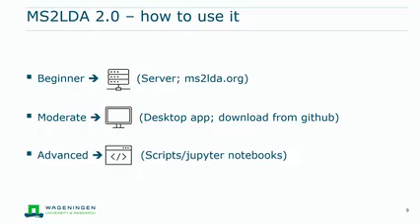Okay, that's most of it, or a little bit more than half, that's fine. Everyone else, if you have someone close by who has Python installed on the laptop, maybe group together. That would be nice. A few can try to use the server, but no promises. The server is really weak, so it can crash, then let us know. And I have one spare laptop I can give to a group who says installation is not going to happen today.